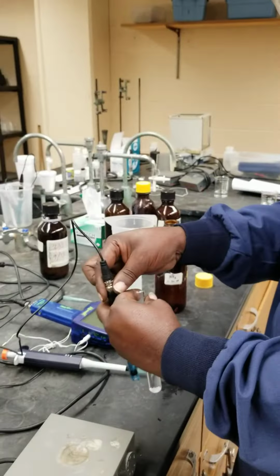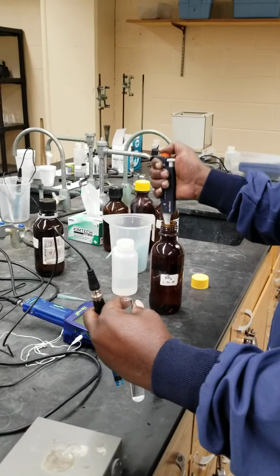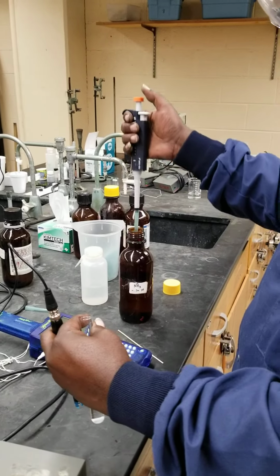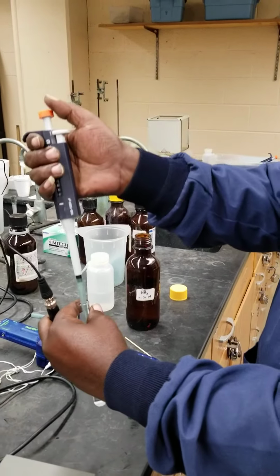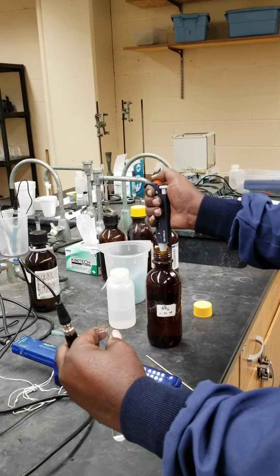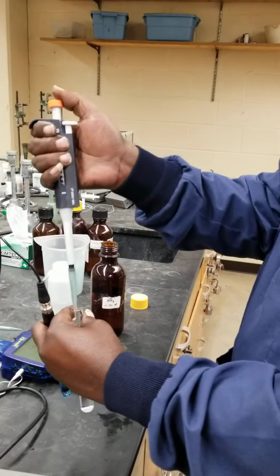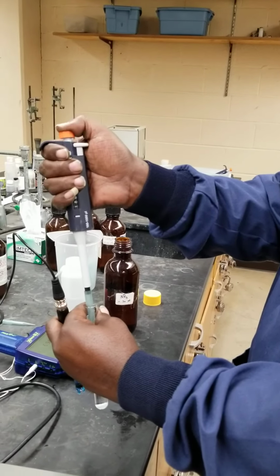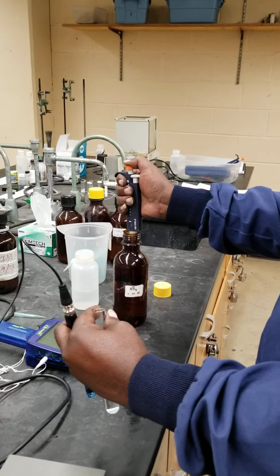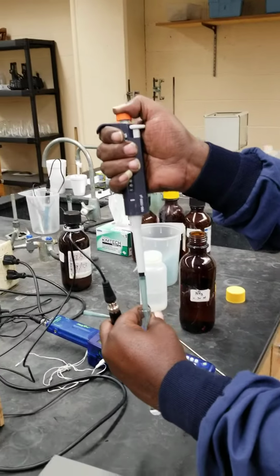Now moving on to add the second set. One. Two. Three.